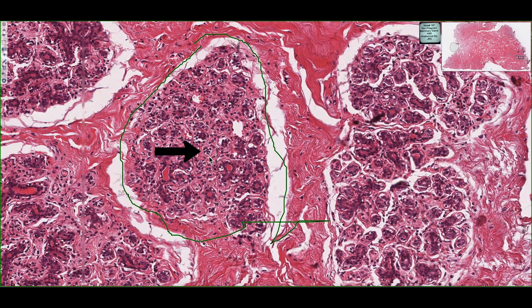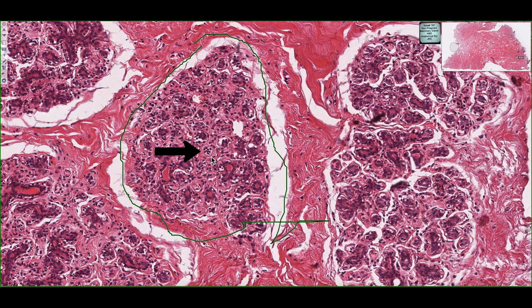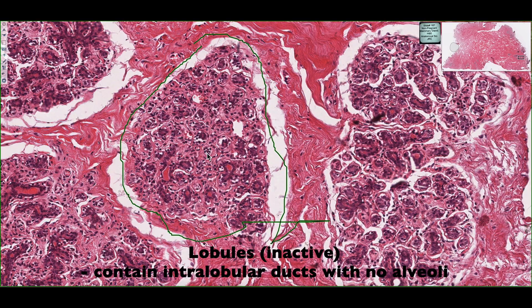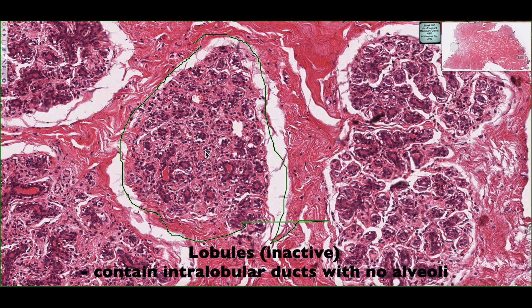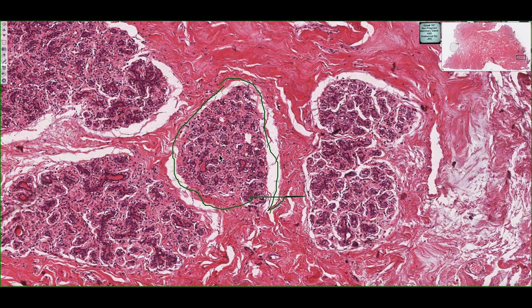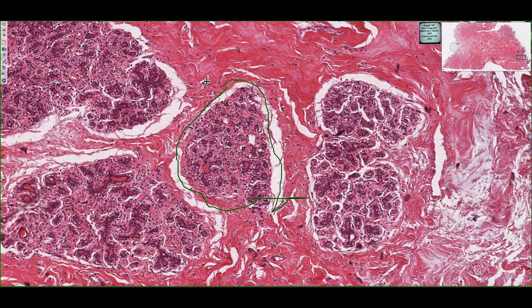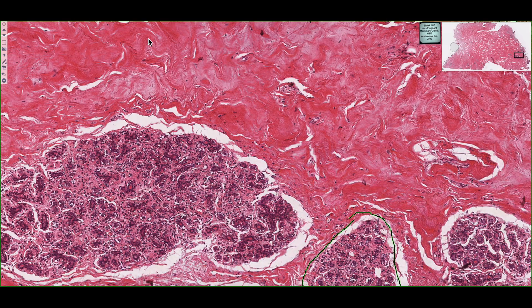This is an example of a terminal duct that I'm outlining. It's sort of circular because it's been cut in cross-section. Normally it would have a layer of low cuboidal cells surrounding it and a lumen. But due to the fact that this gland is inactive, and likely also due to processing, we actually don't see the lumen of this duct. Since this duct is inside this large lobule, they call it an intralobular duct.